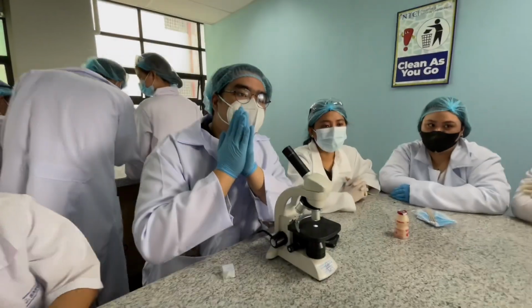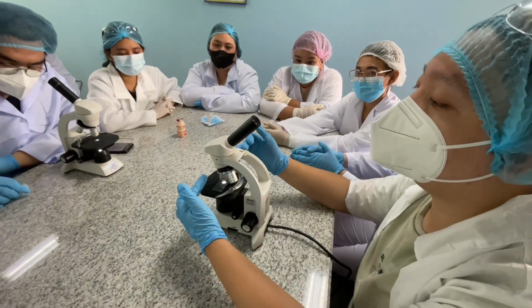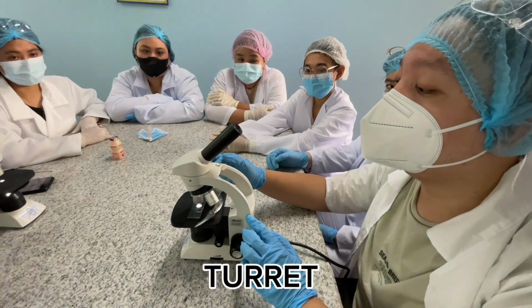Okay. Now, moving along, after you find out how you use the eyepiece, is for us to find out what these components here are. So the circular disc is what we call the turret or the revolving nose piece.